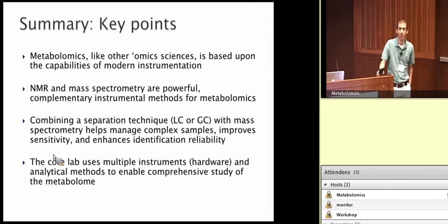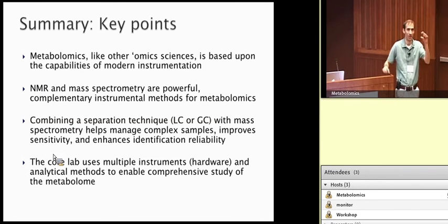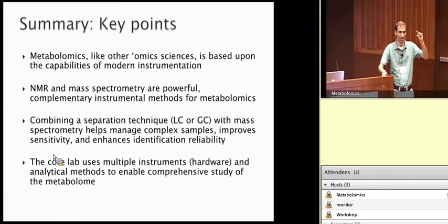Right. Well, metabolites are chemical fragments that are present in your initial sample. All fragments of a metabolite generated in the process of doing LCMS are effectively artificial, right? They weren't in your solution to begin with because they were generated by the collision-induced dissociation, or even if you weren't intending to do it earlier on in your instrumental analysis method. So in that sense, all fragments are artifactual, are not what was in your original sample, right? They can be very useful because they can help you figure out the structural information. But yes, definitely, in the process of doing the analysis, we look at those.